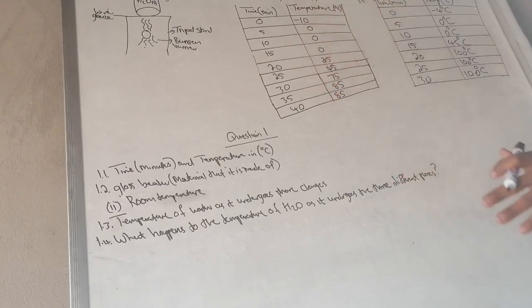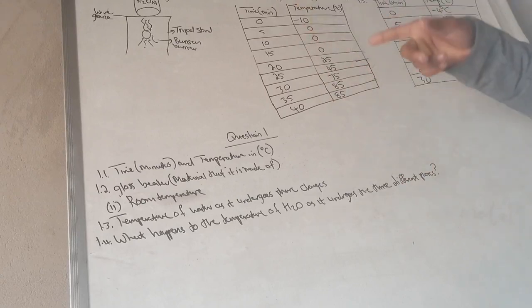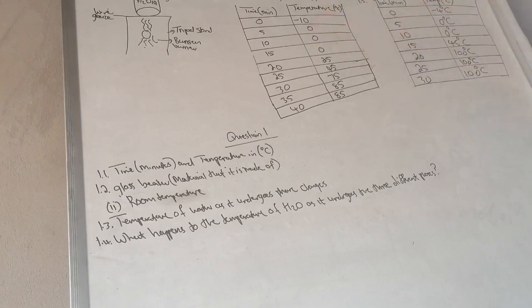This is highly problematic. I don't know whether this beaker was the biggest beaker we could ever imagine that will take so long for water to boil. Maybe this was the minimum with a very small radius. So that is why water boiled so quickly. But this shouldn't be the result. The bottom line, this should have never been the result obtained.